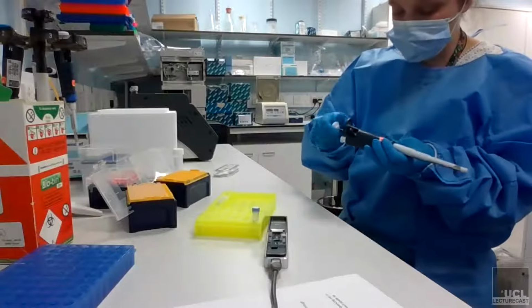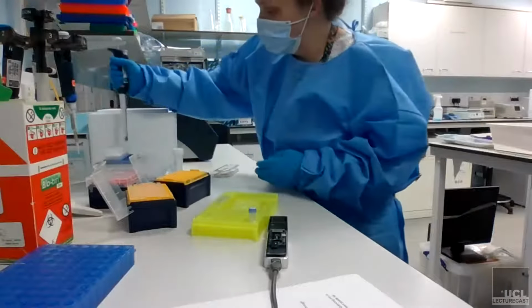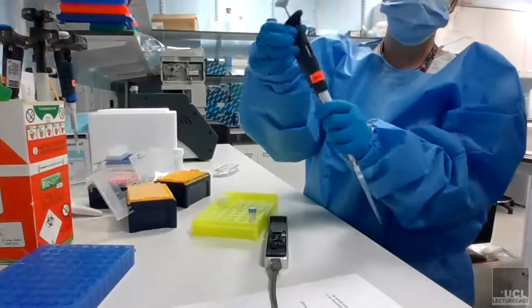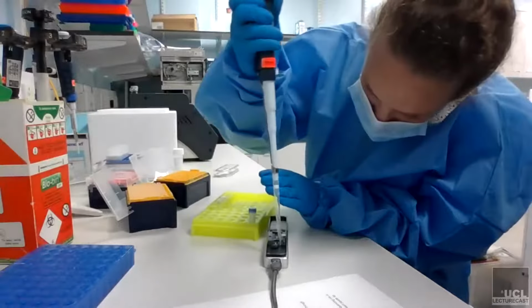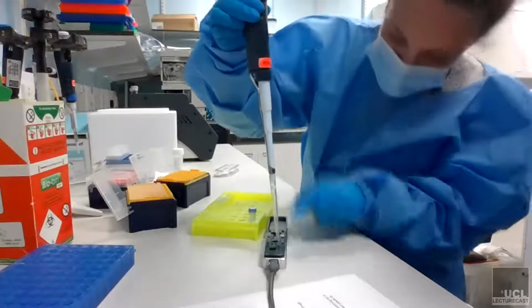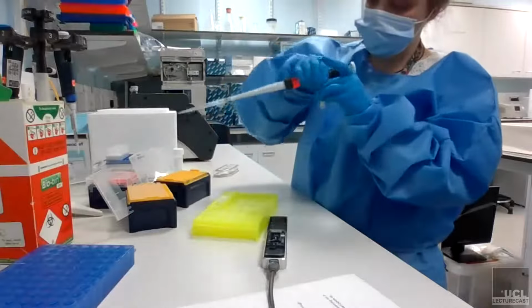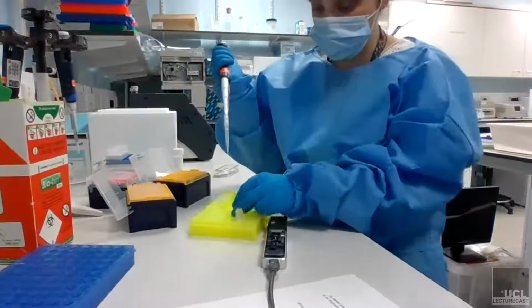So to start with, you need to add 800 microliters of your mixed priming buffer. But to absolutely make sure you've got no air bubbles, and I can see there that that is air, not liquid, always use the spinny thumb wheel, not the plunger, because you've got more control over that. Stick the tip of the pipette in and pull it up until you see liquid. So now you know that there's liquid from the hole all the way through to the pores. First we check we really have liquid inside. Okay, you need to pull it back to make sure there's no air in it.